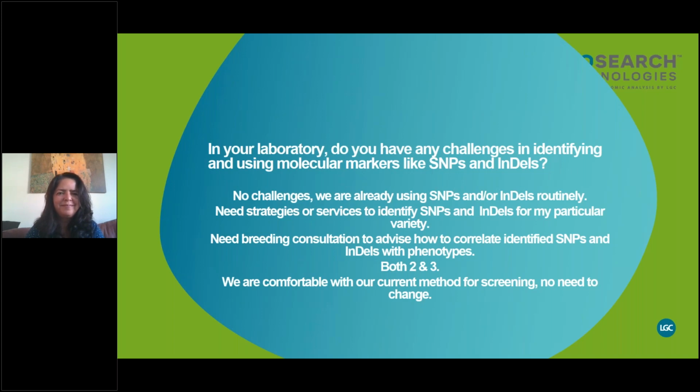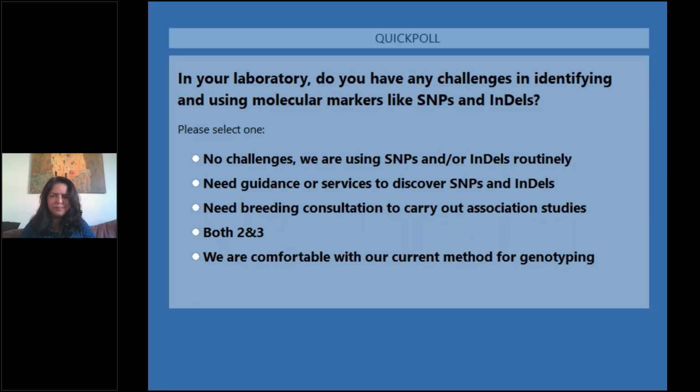Okay, and this will bring us to the second of our 3 audience polls today. And this one, again, asks about experiences in your lab. So in your laboratory, do you have any challenges in identifying and using molecular markers like SNPs and indels? So no challenges, we are already using SNPs and indels routinely. Maybe you need guidance or services to discover SNPs and indels, or perhaps breeding consultation to carry out association studies. Perhaps you need both, the second and the third choice there. Or maybe you're completely comfortable with your current method for genotyping.